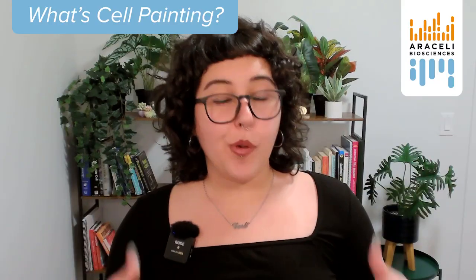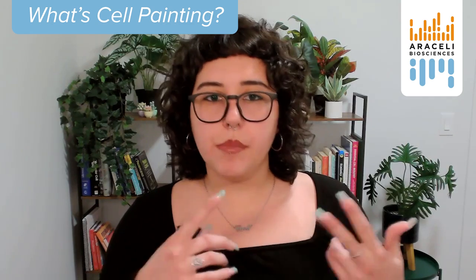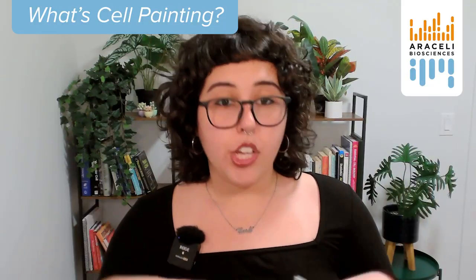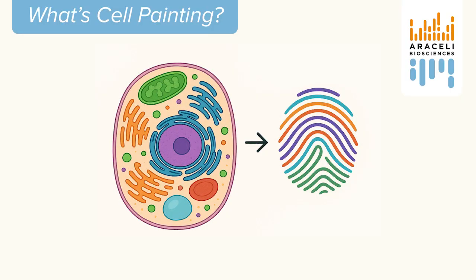Let's start with the basics. What is cell painting? Cell painting is a high-content imaging assay. So the idea is to stain different compartments of the cell, meaning the nucleus, the mitochondria, the endoplasmic reticulum, and even the cytoskeleton, all with fluorescent dyes, all at once. You can then capture those images at high resolution and extract hundreds or even thousands of morphological features. The end result is what's sometimes called a morphological fingerprint, a very detailed profile of how a cell looks and changes under different conditions.